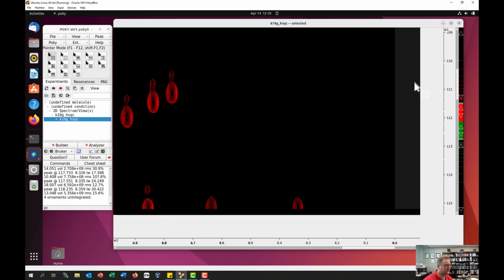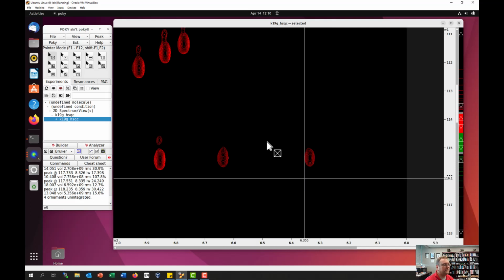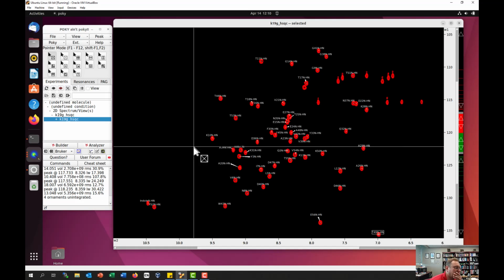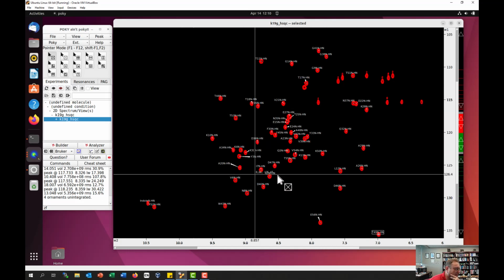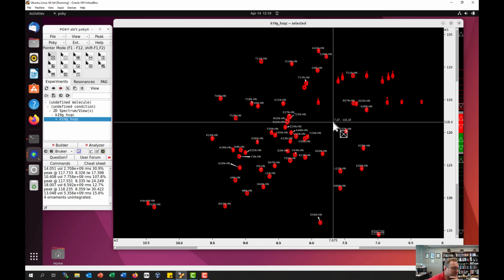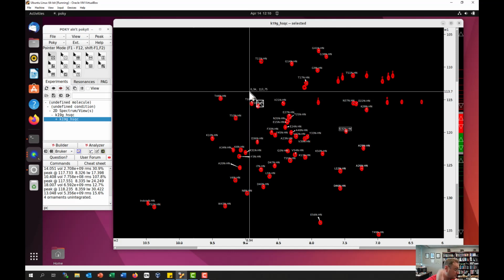And there's no more new assigned peaks here to center. So now I can hit V, capital S, and that turns off those slices. And if I type lowercase z, lowercase f, you can see I have my full spectrum back, right? And all the peaks are aligned. In this case, all of the peaks are nice and visible. Further centering the peaks doesn't do anything. And we're in a pretty good spot.